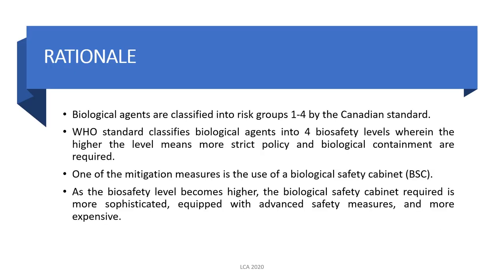According to the Canadian standard, biological agents are classified into four risk groups: agent risk group 1, 2, 3, and 4. But today we are actually following the World Health Organization standard, wherein they classified biological agents into four bio-safety levels — BSL 1, 2, 3, and 4 — wherein the higher the level means the policies are more strict and biological containment is always required. One of the mitigation measures is the use of your biological safety cabinet, classified under engineering controls as seen in the hierarchy of mitigation control measures. As the bio-safety level becomes higher, the biological safety cabinet required is also more sophisticated, equipped with advanced safety measures, and of course more expensive.